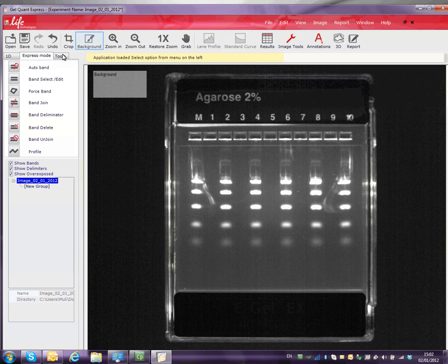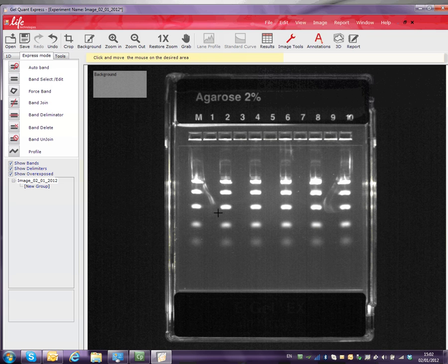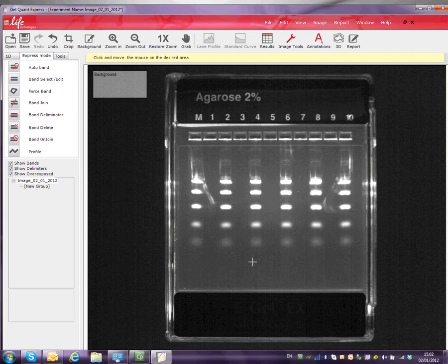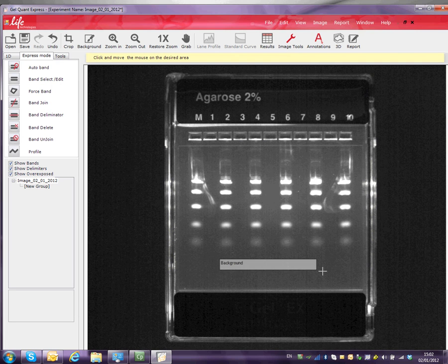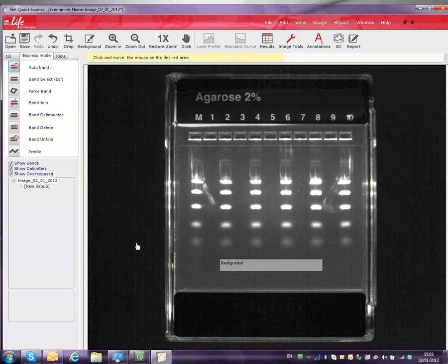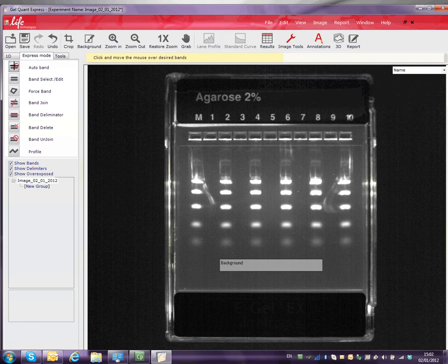Make sure to choose a representative background section on your gel. Then, select the Auto Band button. Using this tool, draw a line through the bands you would like to compare.